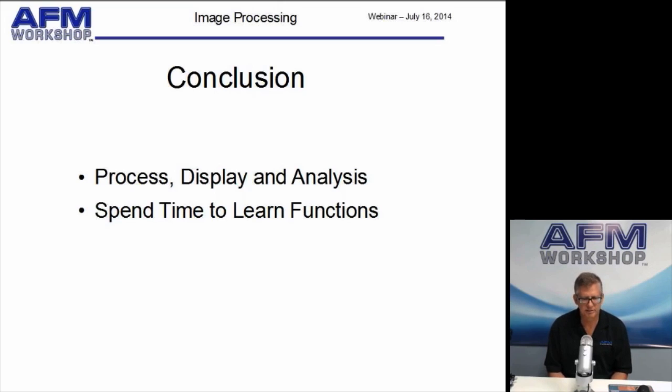Any more questions? Okay, one more question. Can Gwyddion be used on TIFF and JPEG images? I believe it can. On Gwyddion, if you go into the file import, it has a lot of options, and I believe you can import those types of images.